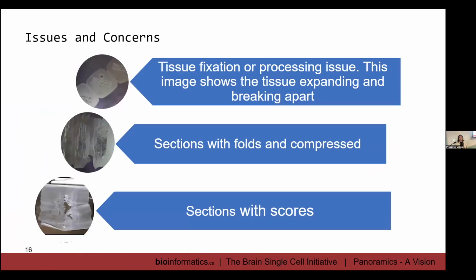Okay. So now you know how tissue sectioning is done and how it's actually floated. That's called floating onto a water bath. So once you have that, now just imagine these tissues are in this water. You're trying to put this in this box that's not very big. It's quite small. And you want to make sure that the region of interest, there were two of them, are within that box. So trying to align that within that area prior to taking it to wherever you need to take it for Visium HD is actually quite laborious.